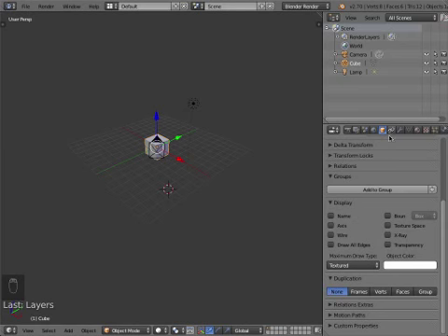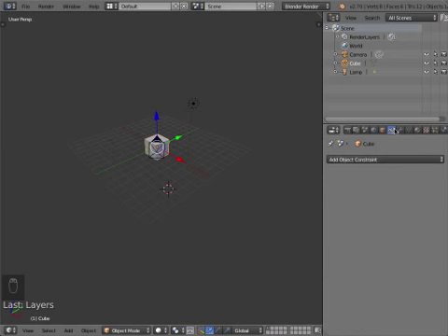And that's it. That's a higher quality rendering type of atoms. And I'll show you another one as well. Constraints, we're not going to use that very much. We'll come to it later.